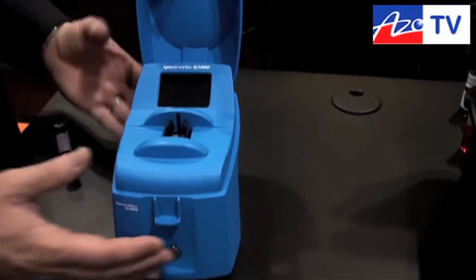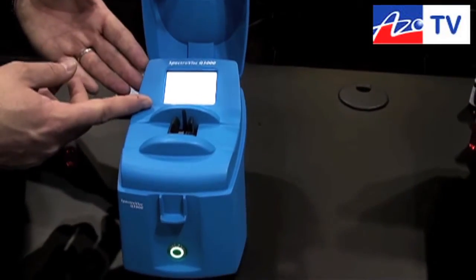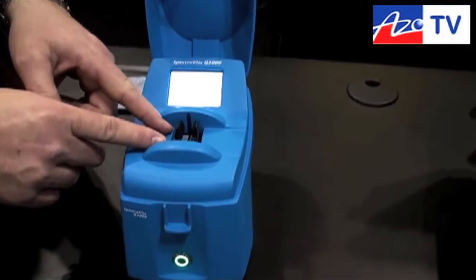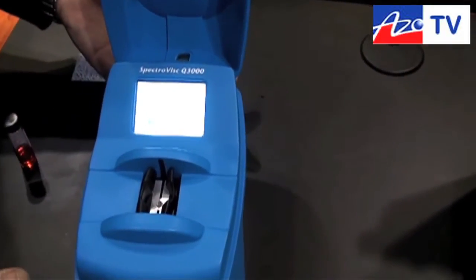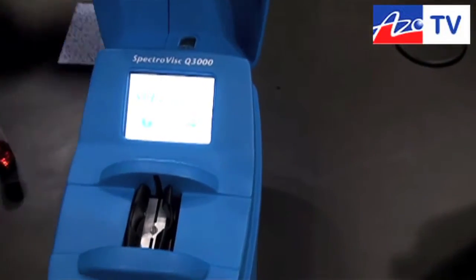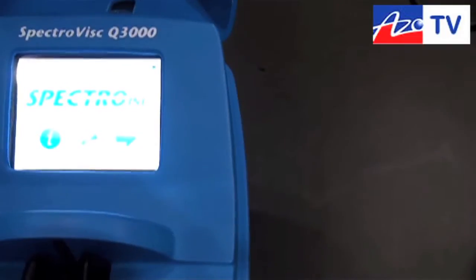This is the device here. It's a very simple system, designed essentially with a touchscreen. It's got a sampling cell cartridge, which we're going to show you in a little minute. It's battery operated, very easy to use, and has multi-language support.